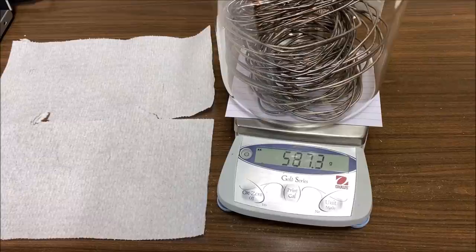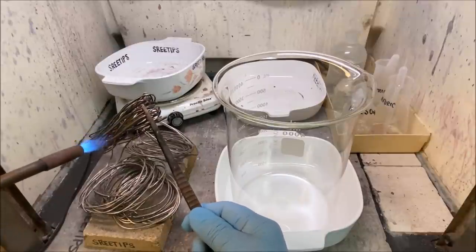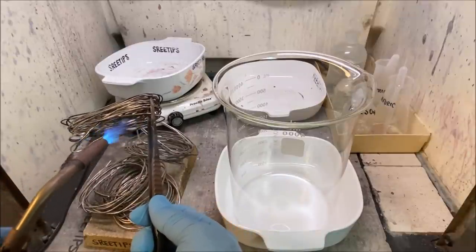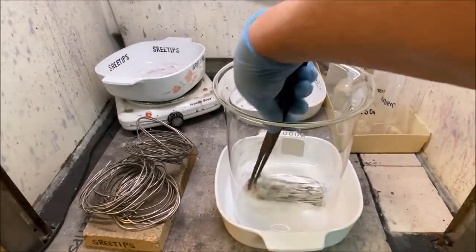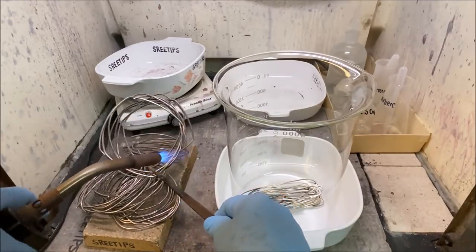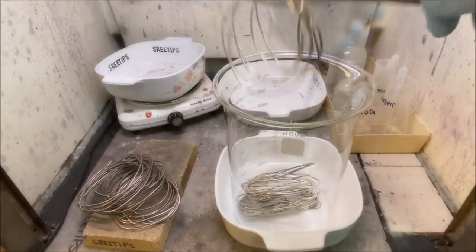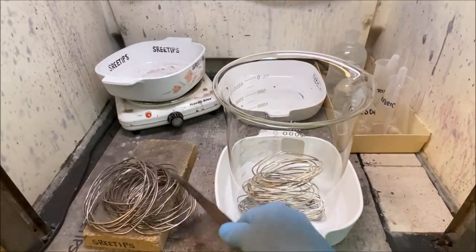We've got 587.7 grams of silver wire. I'm going to burn the silver now to burn off any oil, grease, or anything else that might be on there. You'll notice that the silver turns a different color as we burn it.